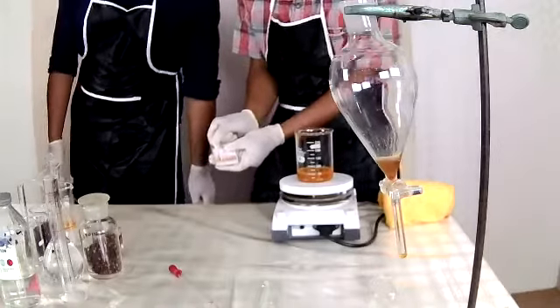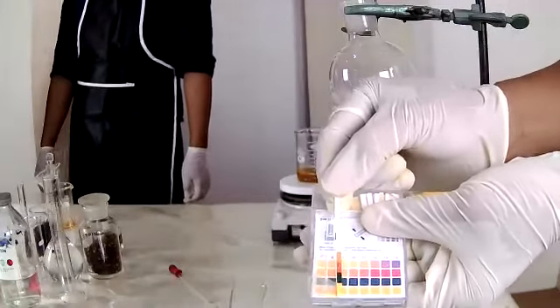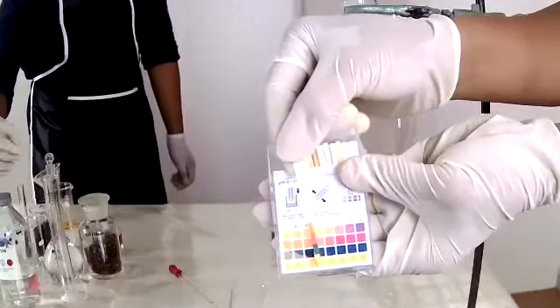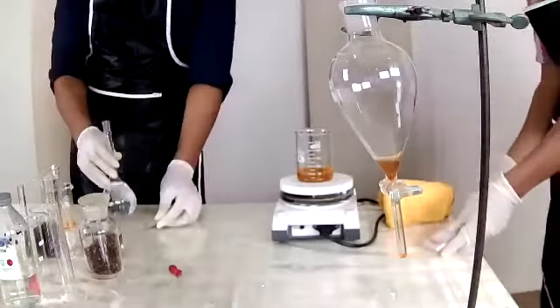The pH is still quite high. It's about 9, around 10. So we can add more HCl.